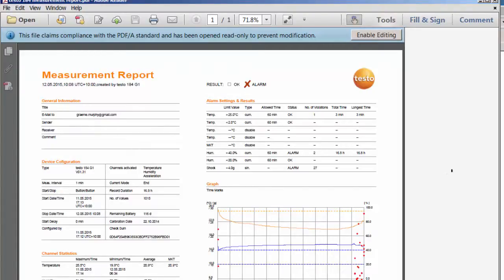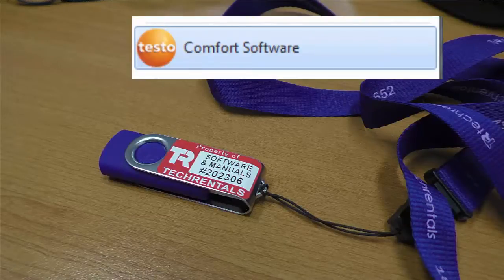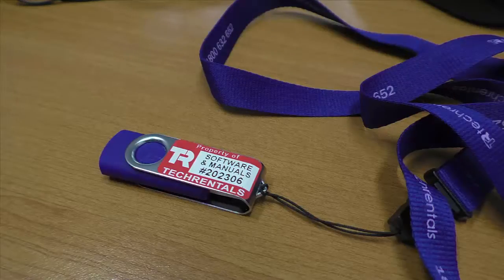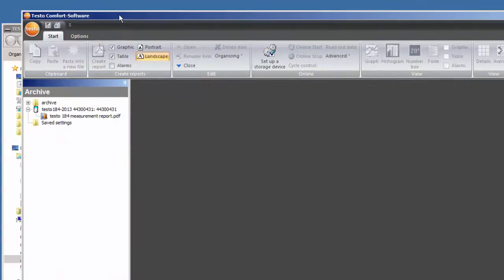Now if you want more detail than this PDF report provides — for example, you may want to load the data into Excel — there is a USB memory stick supplied with the device. On that memory stick is software called Comfort Software. If you have admin rights, you install this onto your PC. If you do not have admin rights, it won't work — you must have admin rights to install this software. We've already installed it on this PC, and there's a code required which is all on the memory stick.